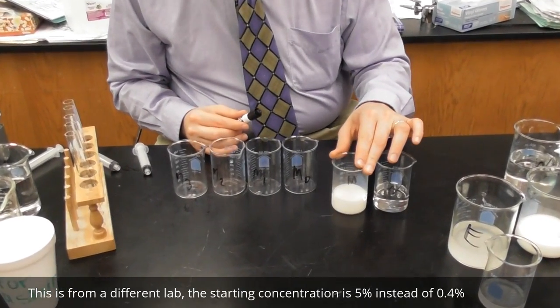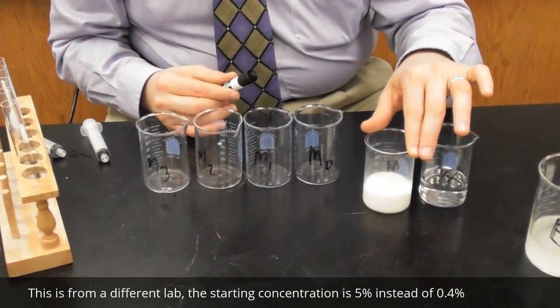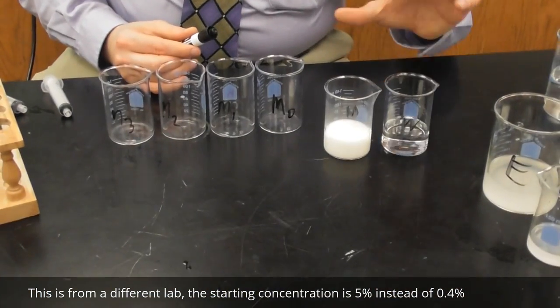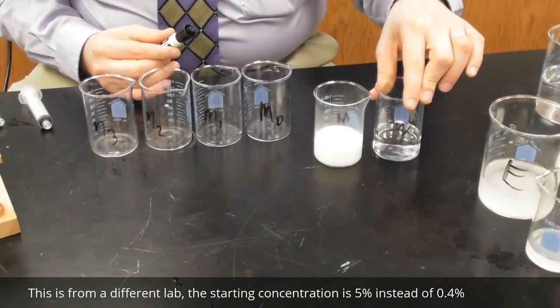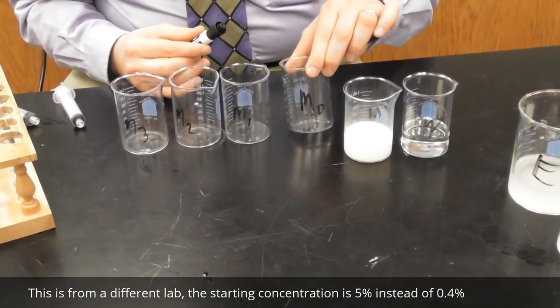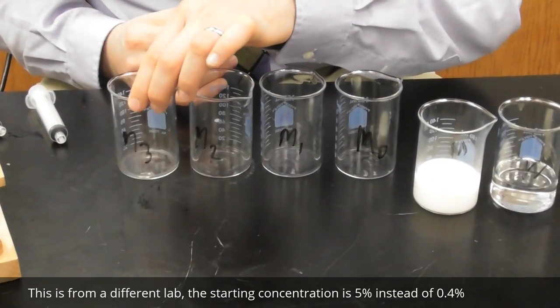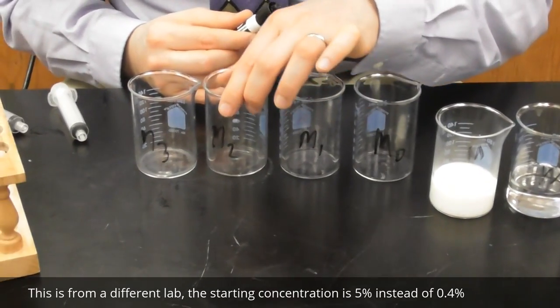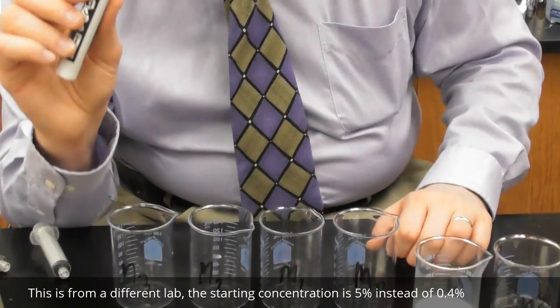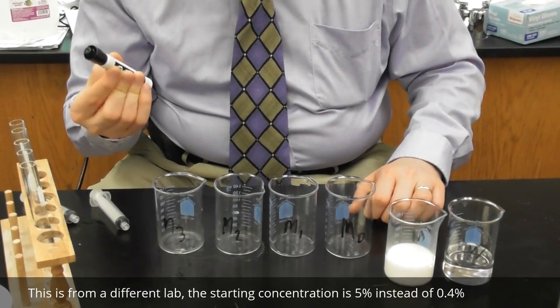So what I've done is I've taken this opportunity. I have here solution M, which is milk, which is 5% triglycerides. Oh my, I hope nothing broke. All right, so, and I have here W, distilled water solution. So I have here triglyceride, milk, 5% M. I have labeled M0, which is my initial M solution. I have M1, M2, and M3. My first dilution, my second dilution, and my third dilution. So I've pre-labeled them with my glass marker pen. It's a dry erase marker, all right? I'm covering the brand name because no buzz marketing.